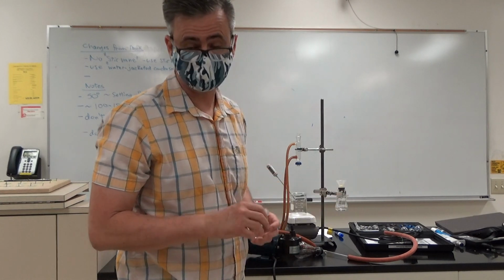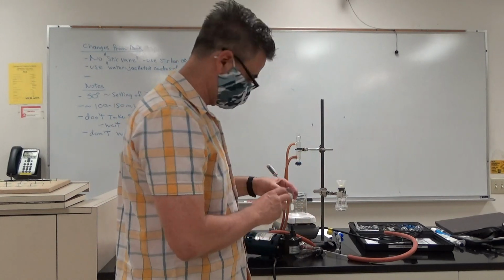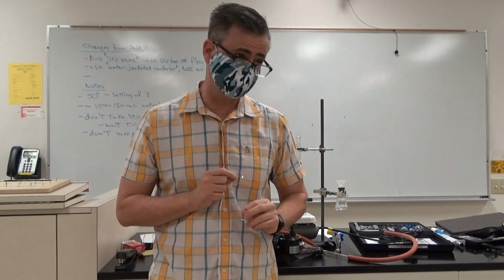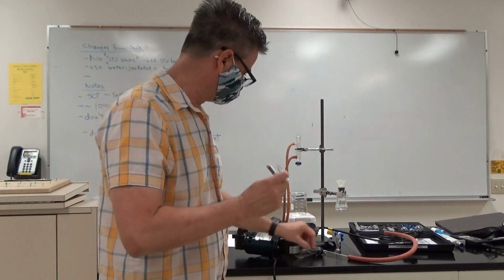Okay? All right. Now, at the very end, after it's dried a little bit, what we're going to do is we're going to take, these are called watch glasses. We're going to take 2 watch glasses. We're going to weigh one of them, okay? And that's going to be the bottom one. Please try to remember which is the bottom one, because these will not weigh consistent things. You're going to get an empty weight. Next week, you're going to get a full weight, okay? So, you weigh the bottom one.